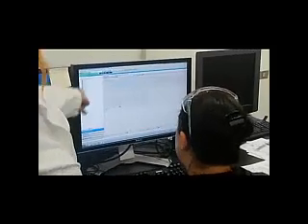Next thing, right? Good. Now go to your HPLC. And you see how you did those 3 things? The 3 things showed up on the left-hand side, those drop downs? Easy sequence, load it, change the name. What's your file? Now save that. The cool thing is you just have to watch it. So you go to instrument control right here. It's going to show you that it's going to start. And now you started.